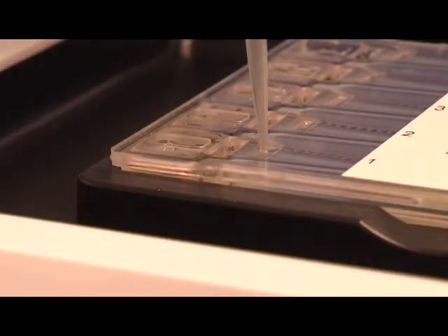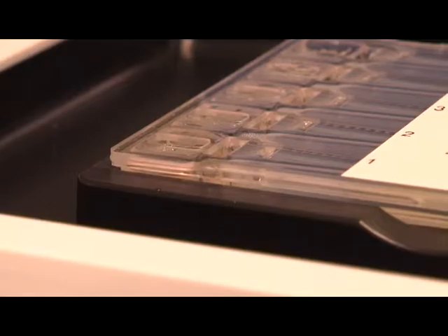Each cassette is packed with 60 microliters of buffer in the sample wells. Using a pipetter, remove 40 microliters of buffer from each well.